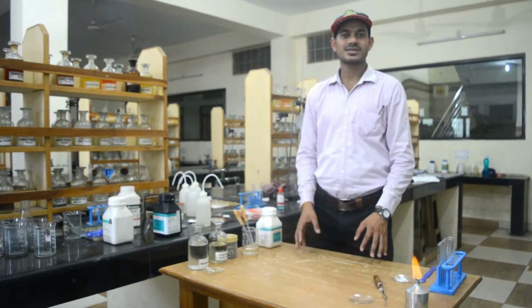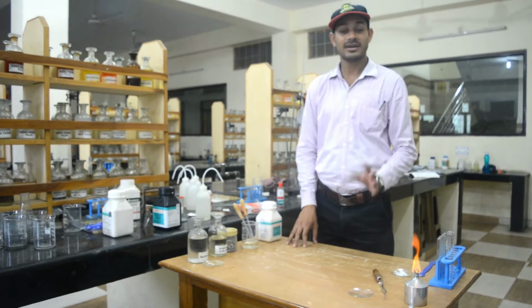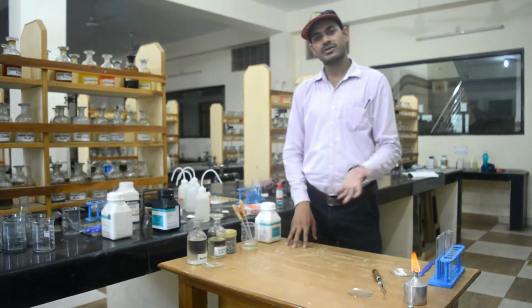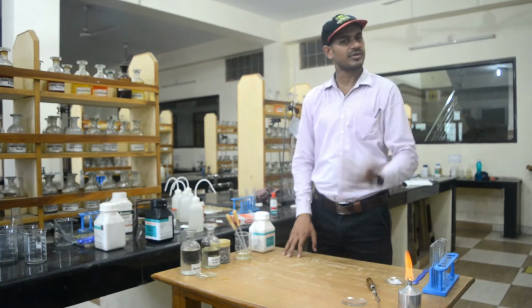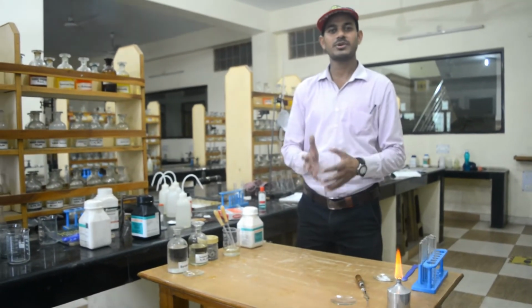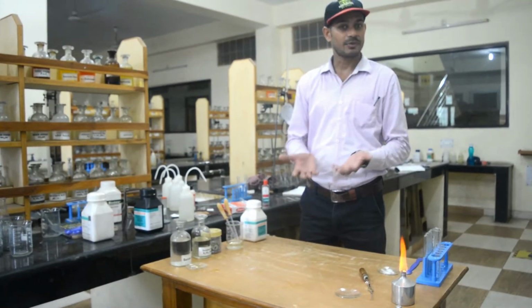As we have already discussed in the theory classes, there are different types of chemical reactions: a combination reaction, decomposition reaction, displacement reaction, double displacement reaction, and redox reaction. We have already discussed them in theory, but today we will perform the practical and see how it actually appears when this type of reaction takes place.